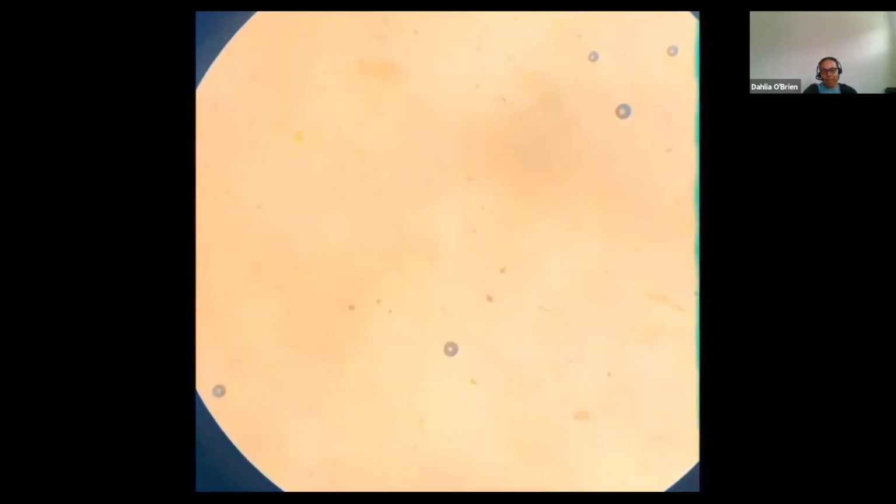I will tell you, we've got sheep here at Virginia State University, and it's pretty good news for us that this time of year there were no eggs that I could find in these samples. Bad for you that you can't see any eggs, but I've got another slide that I'll show in a couple of minutes that will show you some eggs.